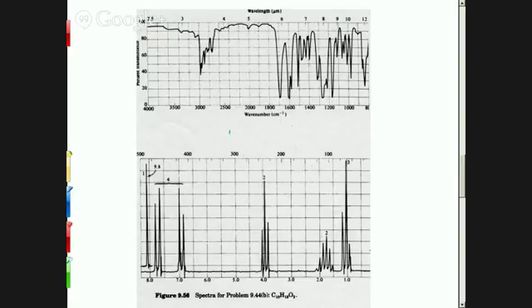So let's look at the IR first, because that actually gives us less information. So it's quicker. What do you see in the IR up here? Anybody get any information from that without looking at a table? The OH stretching. I would say probably not in this one. That's usually higher, like 3,500. We would expect to see a much bigger peak for OH, because that's a strong one.